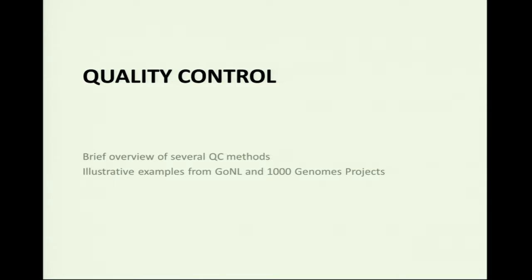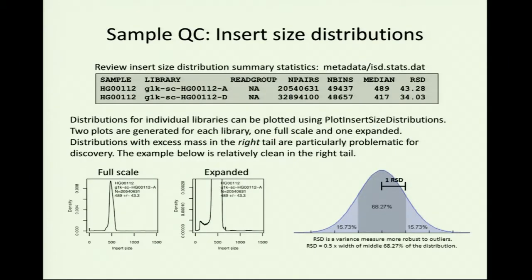So I want to talk a little bit about quality control, and QC methods that you can use, because one of the problems is you run all this software and you don't know whether you should trust the results. There are a couple of tools you can use in Genome STRiP to help get a handle on quality. The filters are getting more robust, and there are more filters built into the standard pipeline. So the situation is better than it was 6 months or a year ago in terms of being able to trust the data that comes out, as long as you look at the filter field.